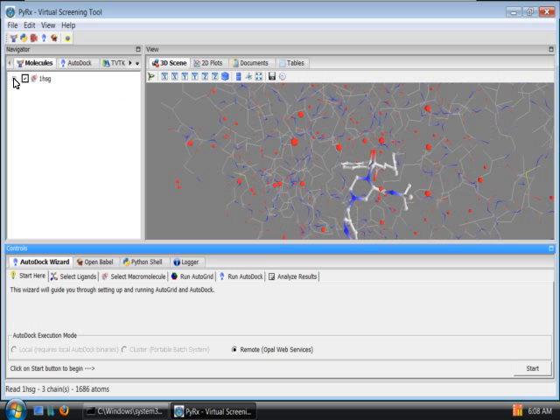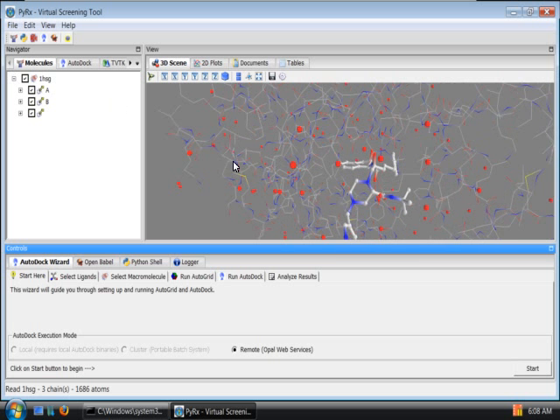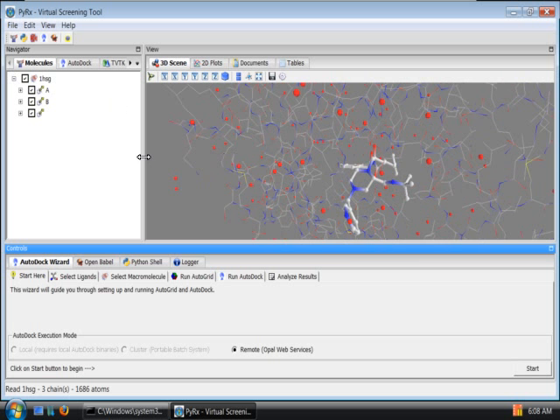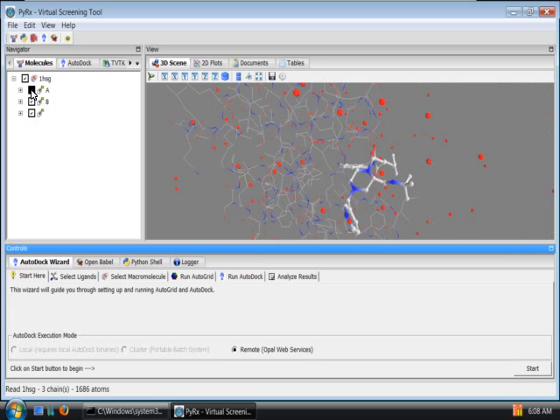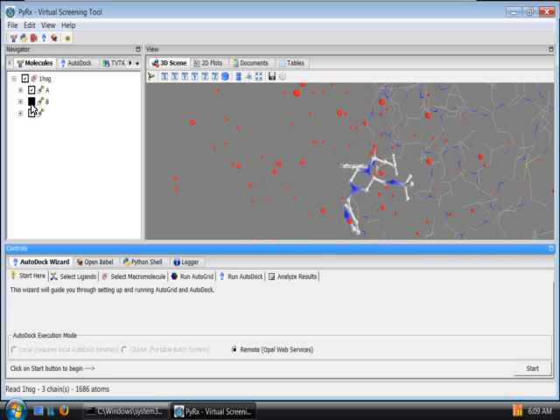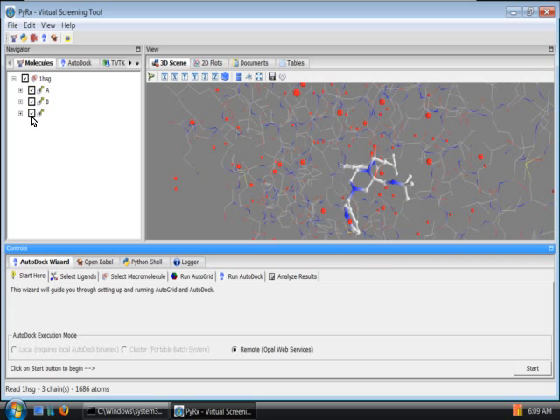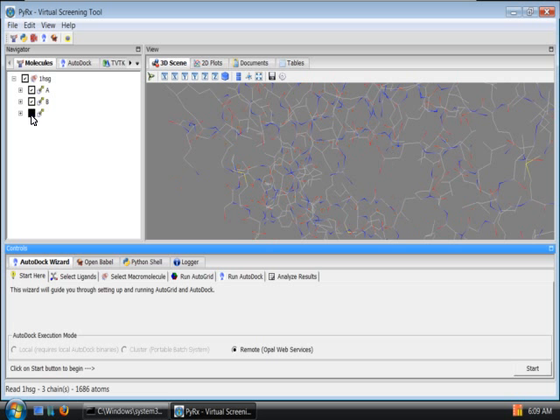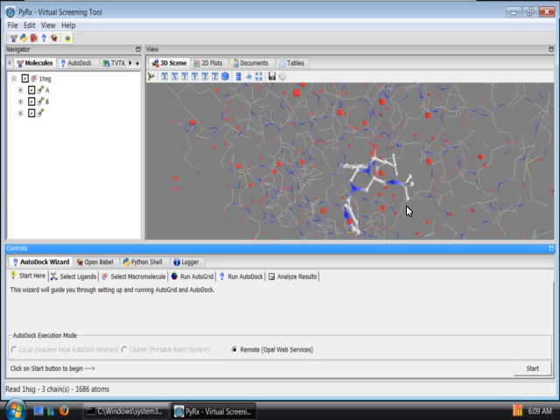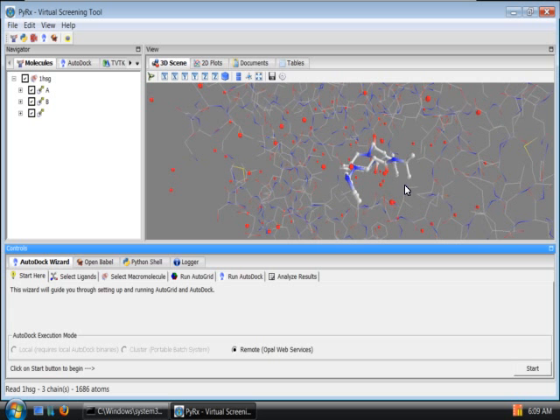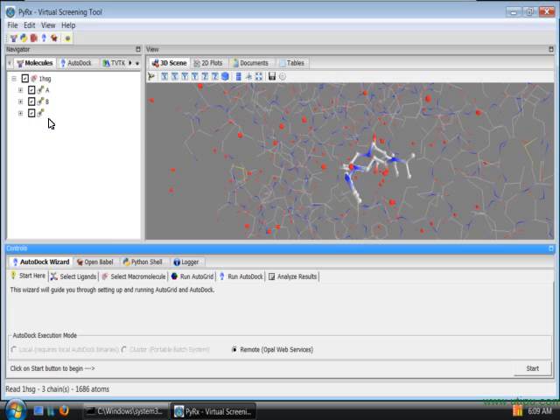onehsg is a PDB for HIV protease and it has two chains, chain A and chain B. On the third chain it stores water molecules as well as this molecule here which is called Indinavir, an FDA approved HIV protease inhibitor.